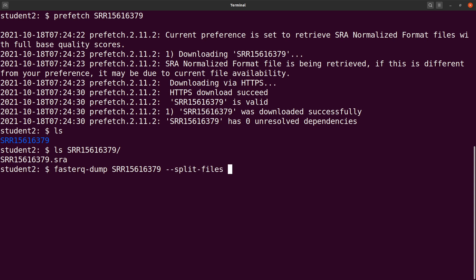We use our option split-files. You can also add another option here called skip-technical. You just have to read about the options and look at the ones which are appropriate for you. Just look on the wiki page and then you run it.